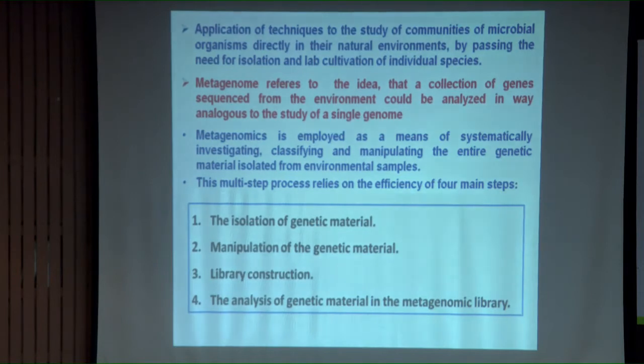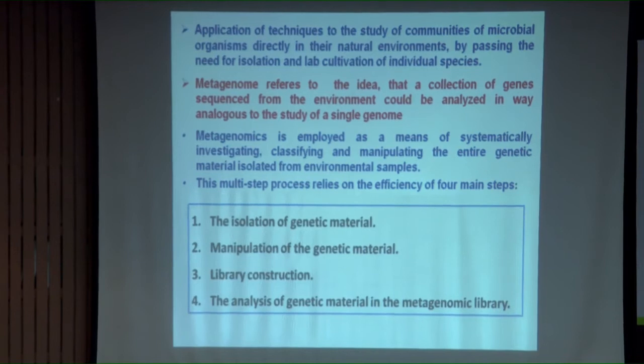You must realize that when we are isolating DNA from soil, we are only taking about 500 milligrams, sometimes even 50 milligrams, of soil. Now, the question is, will that DNA be representative of the whole community? Question number one. So, what do you do?